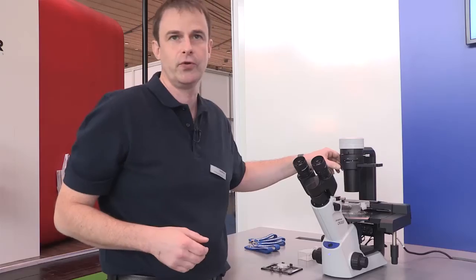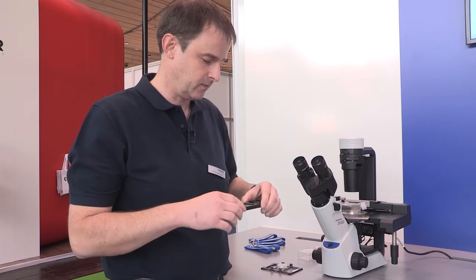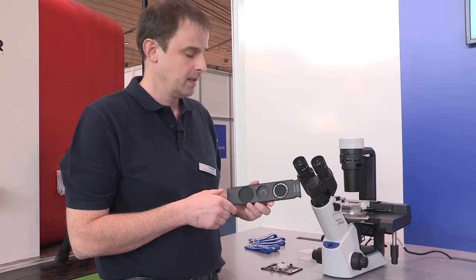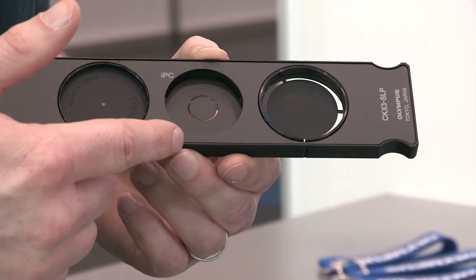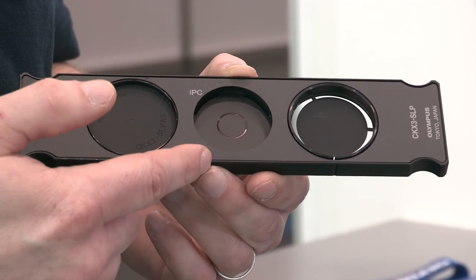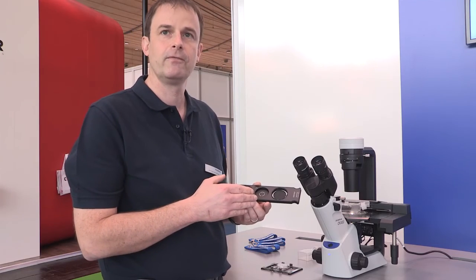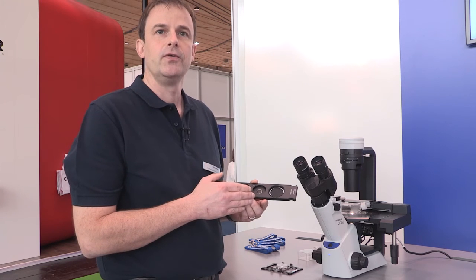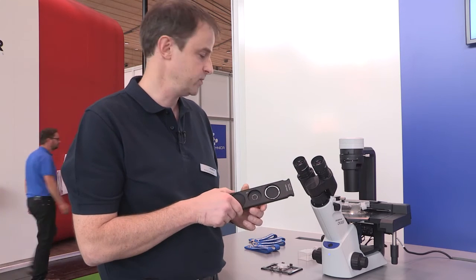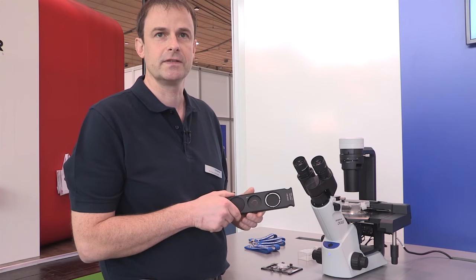Cell culture microscopy doesn't work without a contrast technique. We have further developed the known Olympus integrated phase contrast technique — it's been known for years, but now with this model we are able to extend the range of objectives that can be used with this contrast technique. From a 4x to a 40x objective, you can use phase contrast without doing any adjustments, simply by changing the objective on the nosepiece, and you're always sure the right phase contrast is in place.